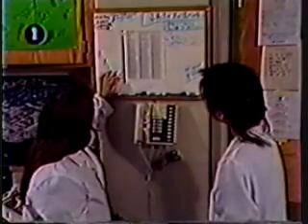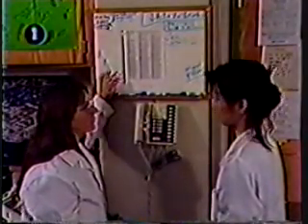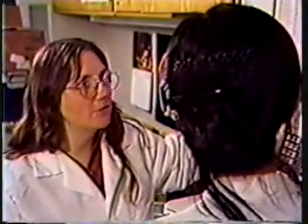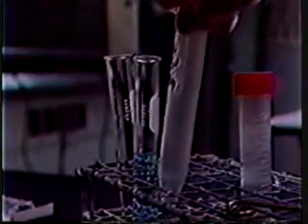You may have asked yourself, what's all this talk about OSHA's laboratory standard on working with hazardous chemicals? And what does it have to do with me? Well, the laboratory standard has been designed to make sure lab workers are informed about potential chemical hazards they may encounter in the workplace, as well as what can be done to protect themselves from such hazards.